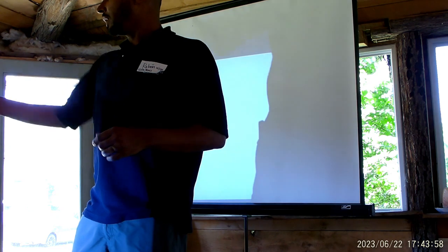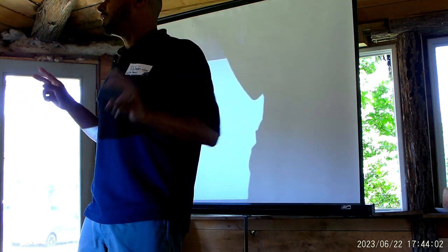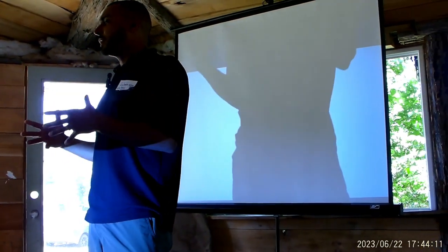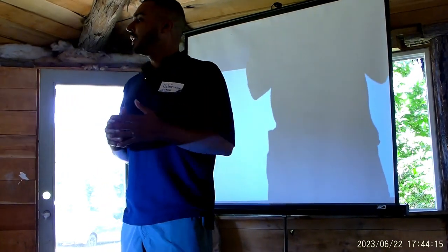I have my colleagues here, John preparing our soil samples for the microscopy, and Melissa preparing samples for the microbiometer. These are the two tools that we're going to be using today to demonstrate how to evaluate soil microbes. Very briefly, when we're talking about soil microbes here, we are talking about specific groups within the soil community.